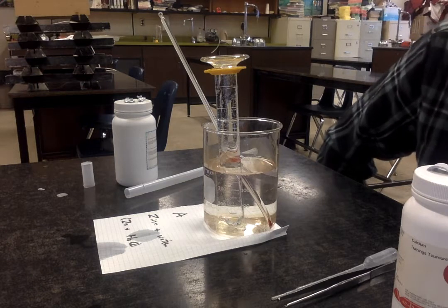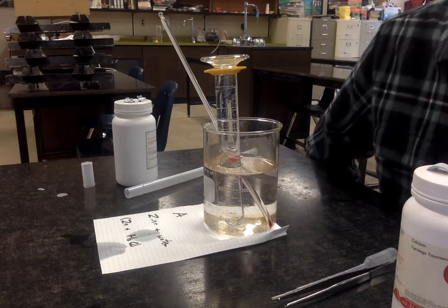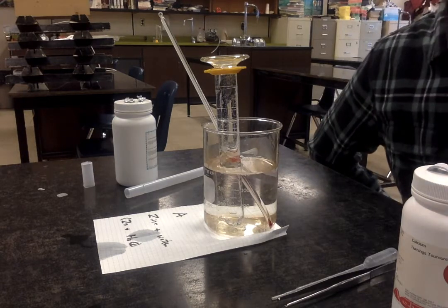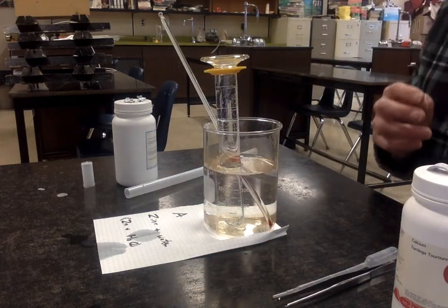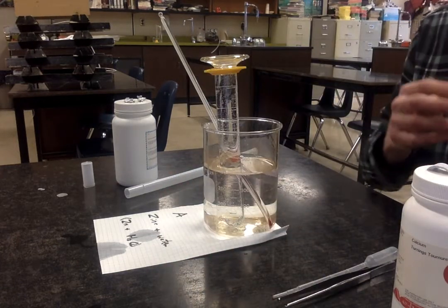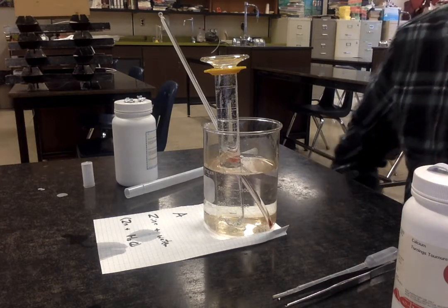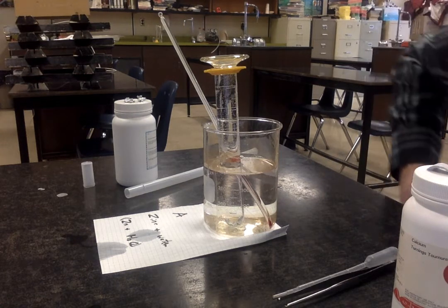All right. So I'm going to come back. I'm watching the time. Right now it's 11:29. I'm going to be watching the temperature now and then. I added the zinc around 11:28. Okay, so we're about a minute in, maybe a bit less. Next, we're going to add the calcium.